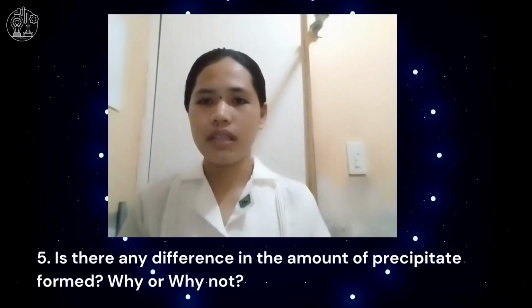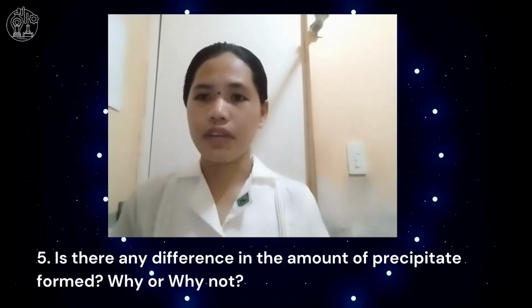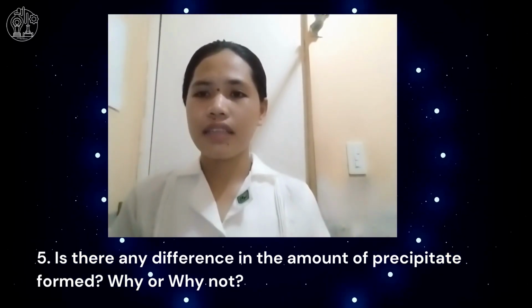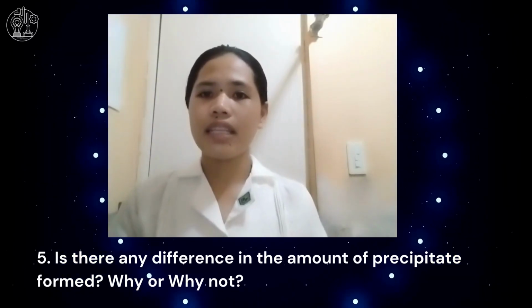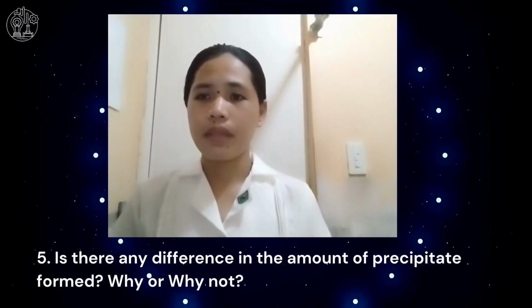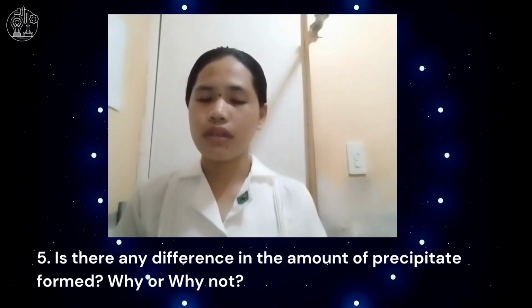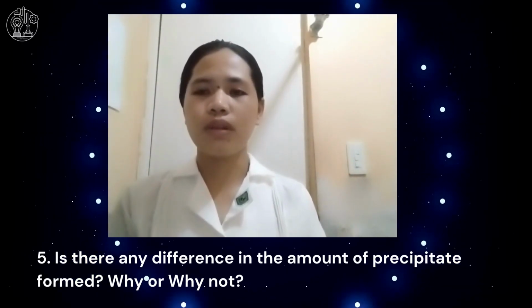Number 5 question. Are there differences in the amounts of precipitate formed? Why or why not? Yes. There are differences in the amounts of the precipitate formed at the bottom of every test tube because we poured different amounts of copper sulfate in every test tube with barium chloride.